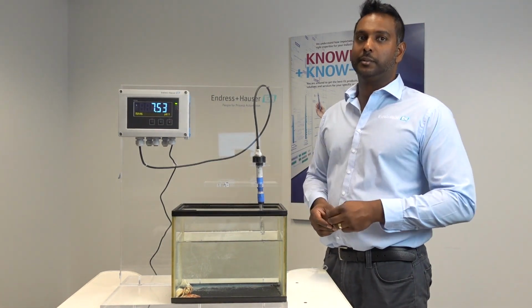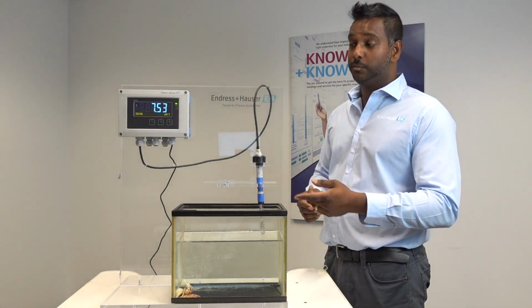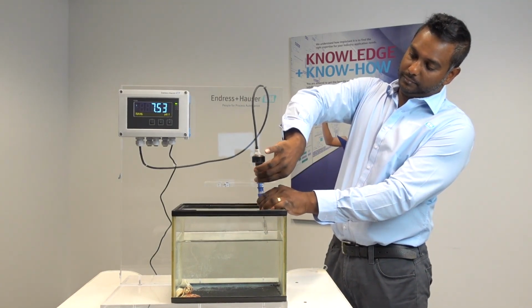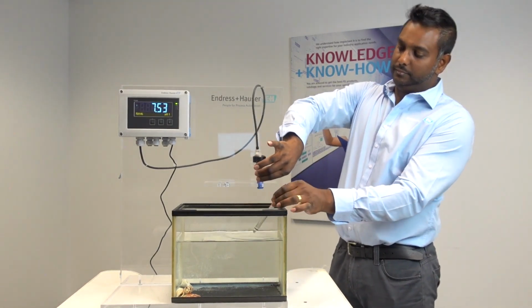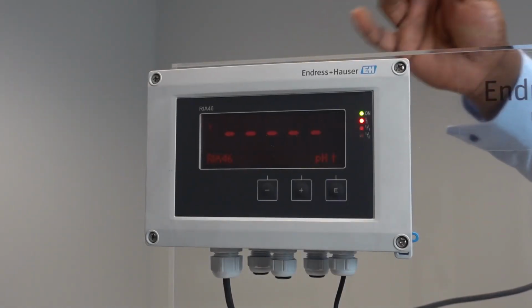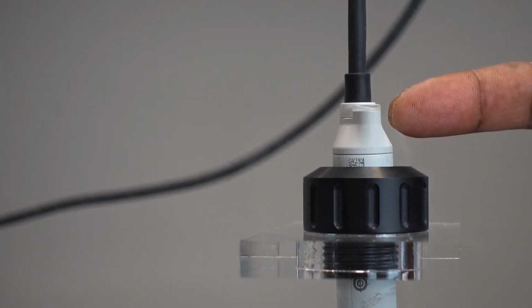And before we go ahead and demonstrate this, I'd just like to show you what would happen if you did disconnect the probe from the setup. Here you can see the RIA46 is alarming with an F45 code. You will also see a red steady flashing light on the CM82.